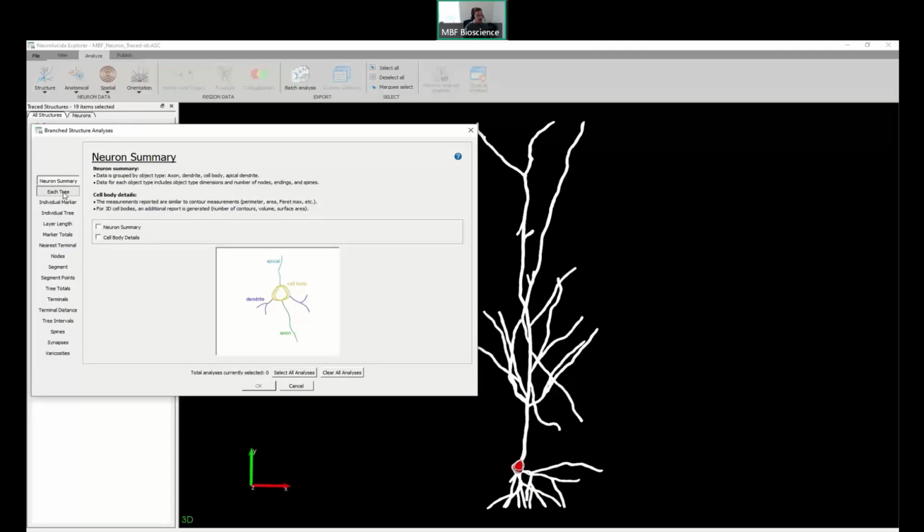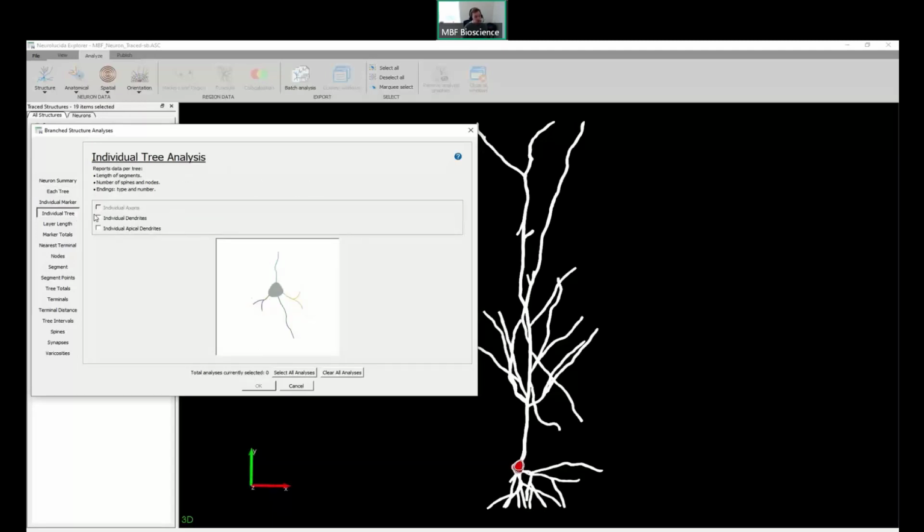And that's true. Although we have each tree, an individual tree, they sound like they're doing the same thing, but one important factor is what's being reported on. If you look at this picture that's generated in the center of the data table or analysis selection window, we can see exactly what's going to be reported on. So when we look at each tree, we're not looking at the total segment, we're looking at individual segments that comprise the larger tree. So anytime we hit any sort of branching space, we're going to consider that a new tree rather than reporting on it in its whole.